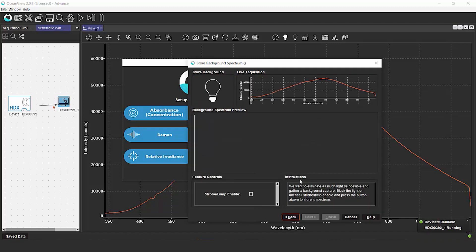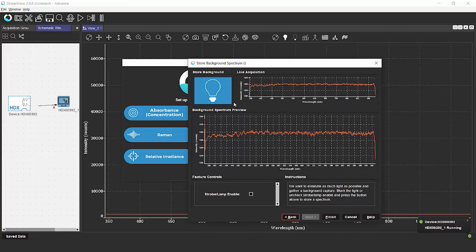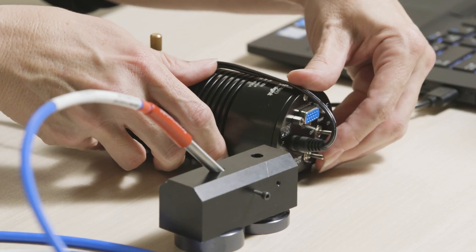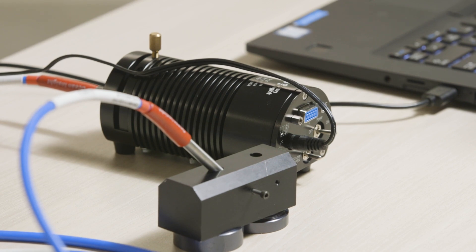We're going to close our shutter again so we can take a dark measurement. We're going to click the light bulb, and we're going to finish the wizard.